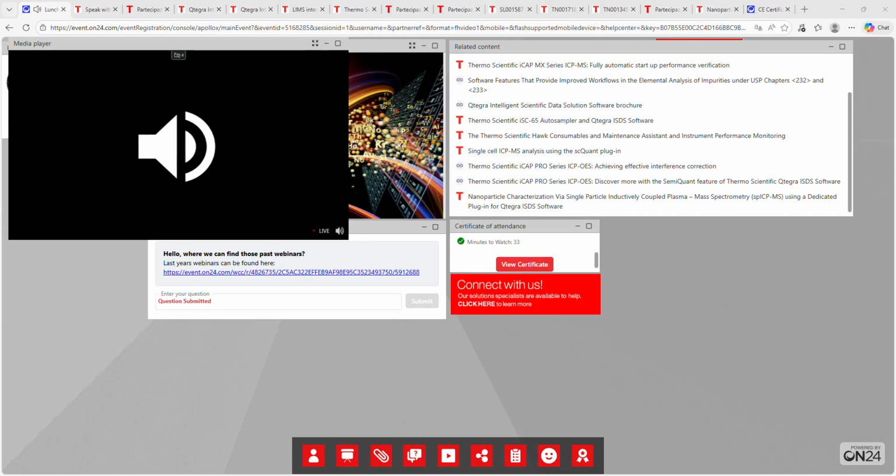Again, different models have different minimum exposure times. So I think the example David showed today was a minimum of 5 seconds. Some of the lower end models have a slightly longer minimum exposure time, so they will be slightly slower. But yeah, you should be able to get it quicker than 3 minutes, definitely.